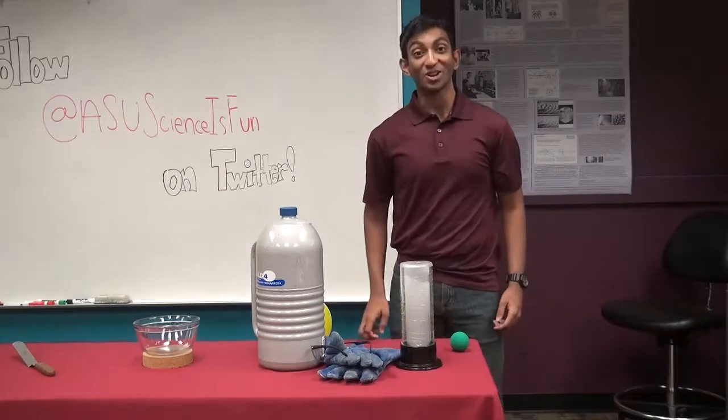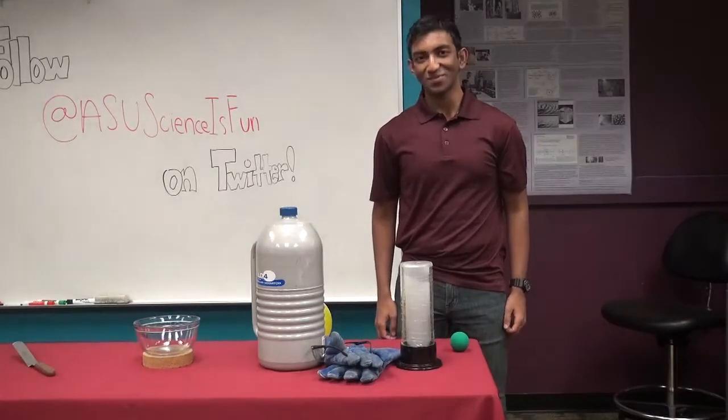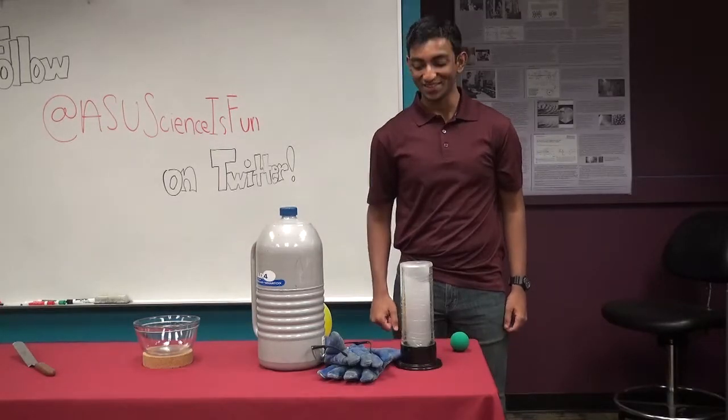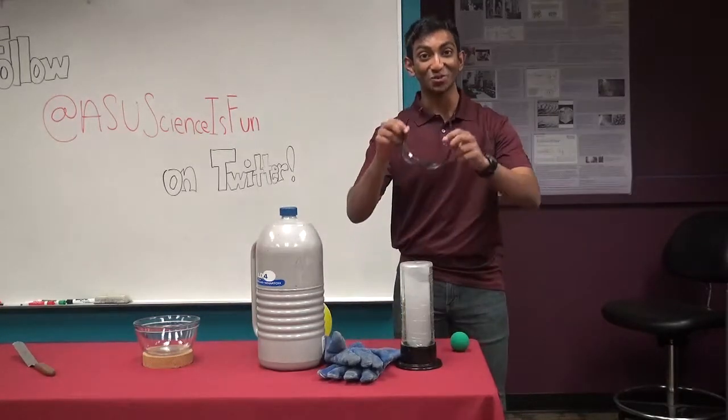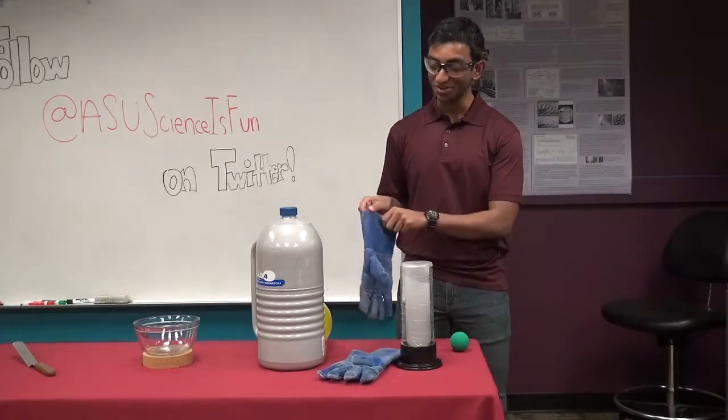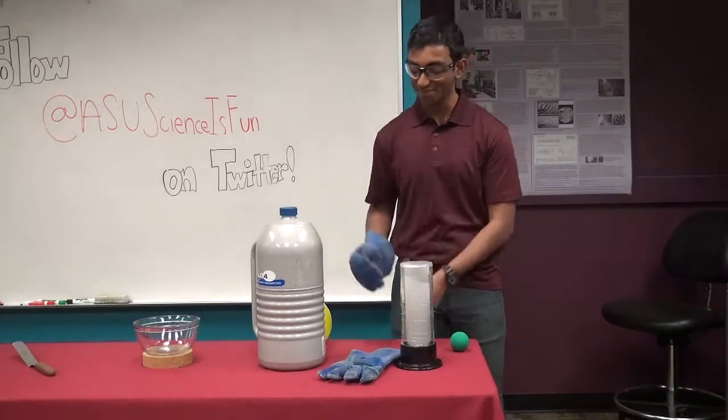Now, today we're going to be working with liquid nitrogen. And as you might know, liquid nitrogen is very cold. So it's important that we practice good lab safety techniques. And part of that is making sure we have safety glasses, and also that we're using protective safety gloves.